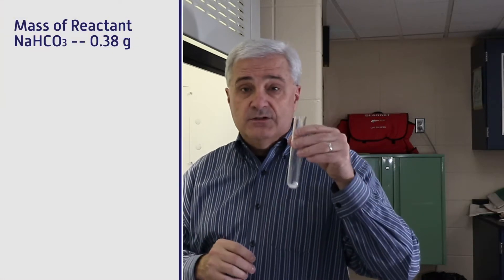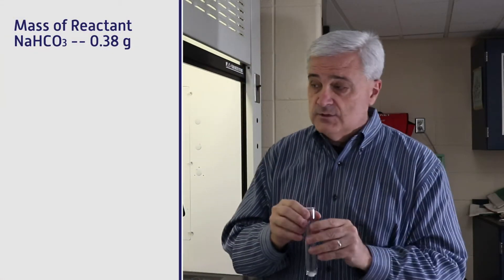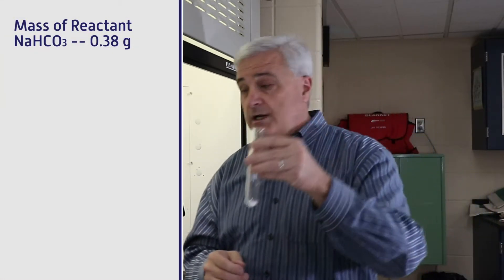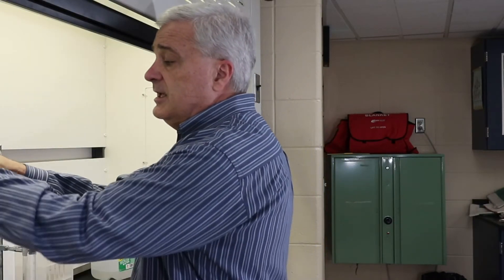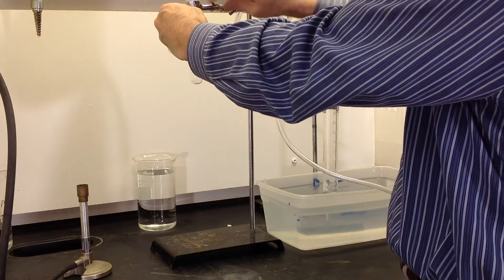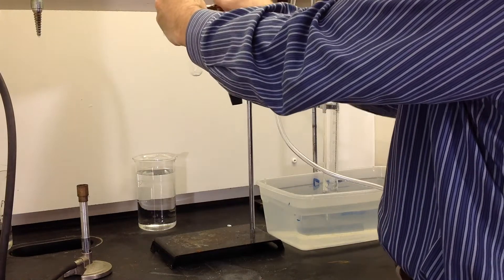What we're going to do is decompose sodium bicarbonate. I've already measured out using the balance 0.38 grams of sodium bicarbonate, and I have put it in this test tube, which I'm going to clamp into my apparatus so that I can have my hands free.